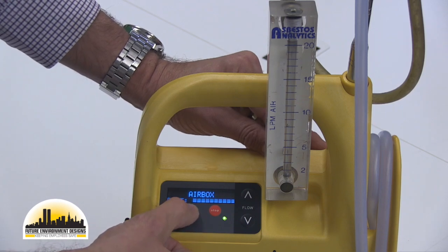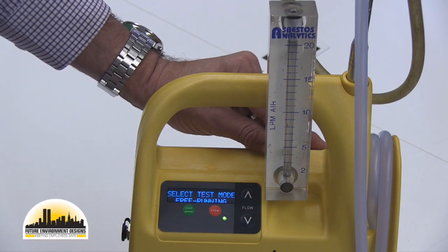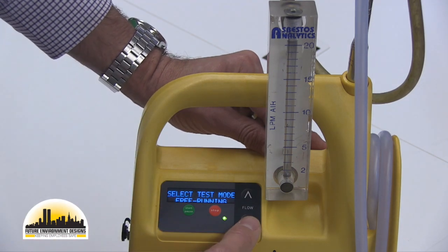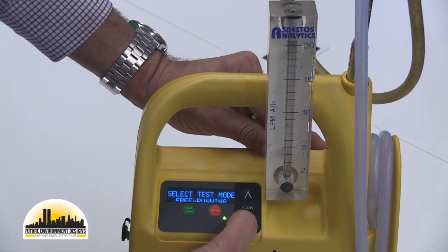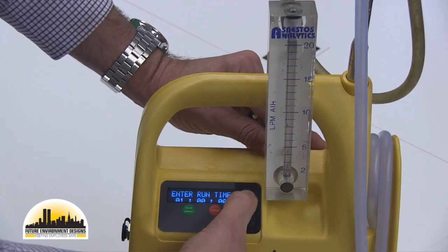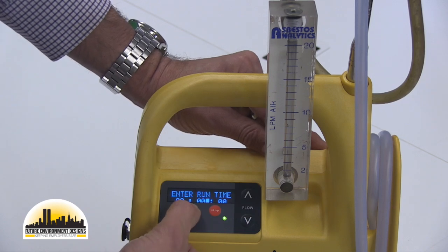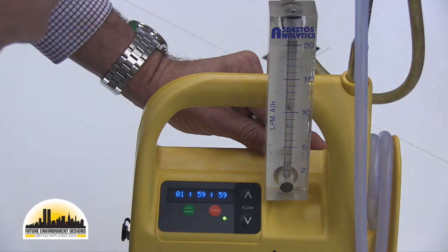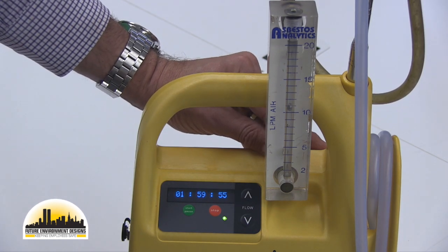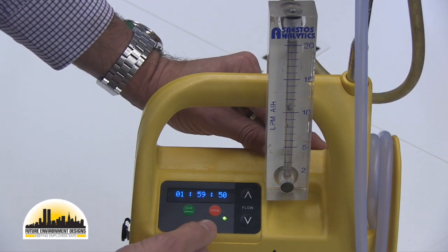The next step is you can have either a free running, so for your ambient monitoring, you can free run, or you can set to a timed test. Let's say, for example, it's a timed test. We can put 2 hours in there. And there we go. So it will work from 2 hours and it'll just count it down. As soon as it gets to the end of the time, the pump will switch off. And it's as simple as that.